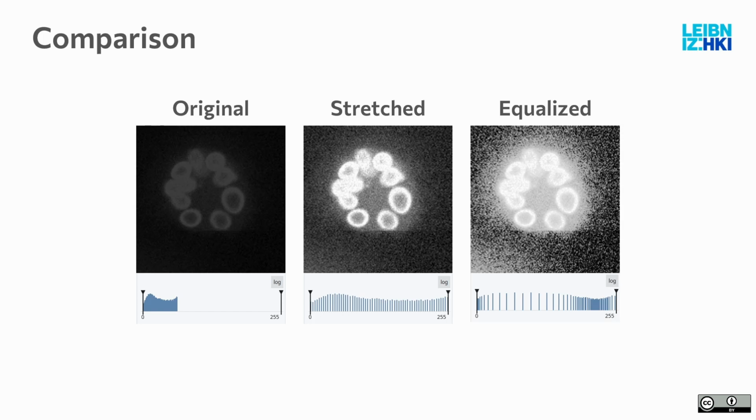So here's the original image. You see here this histogram that only goes to 63. If I apply the histogram stretching with the ImageJ method that is available, then it looks like that. So it's stretched out. And then with the equalization, it looks different now. It has distributed some of these pixel values a bit differently, so they are now super bright.